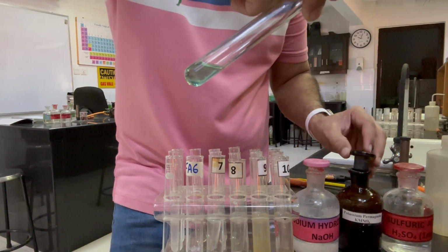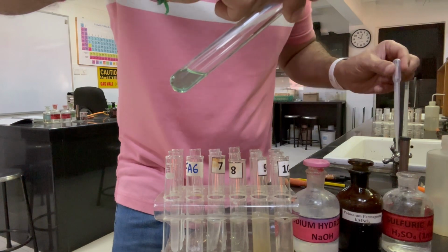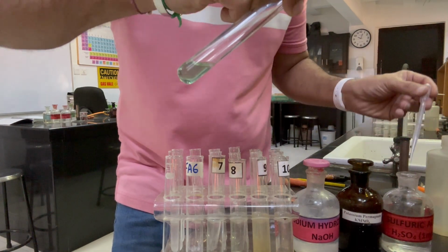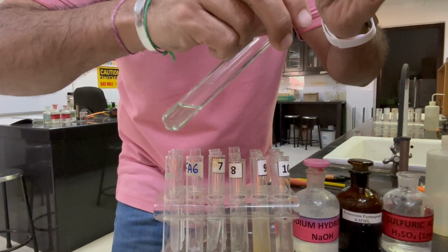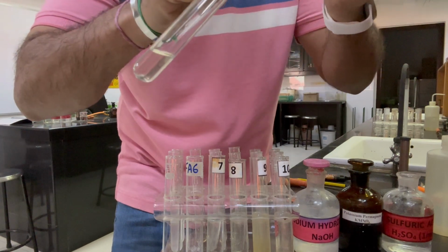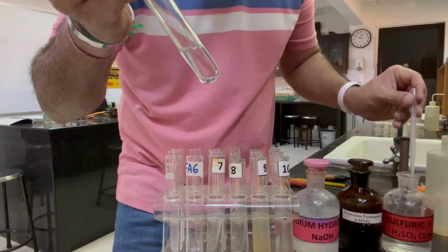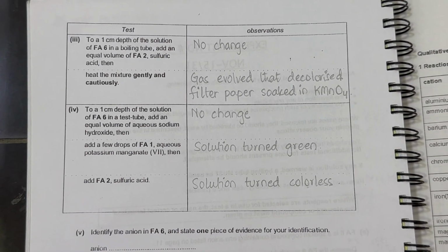Now we will add sulfuric acid. So again, the solution turned colorless. So we will record this observation now. So we have recorded this observation here.